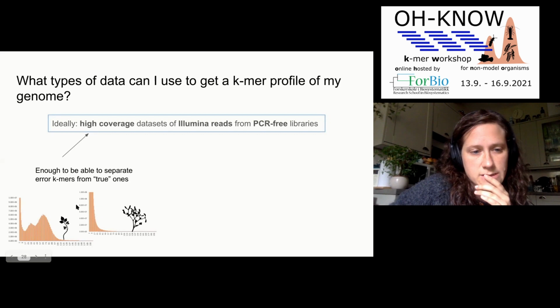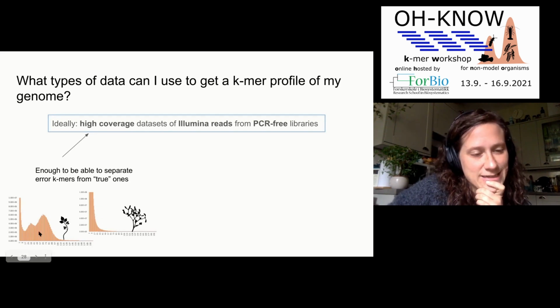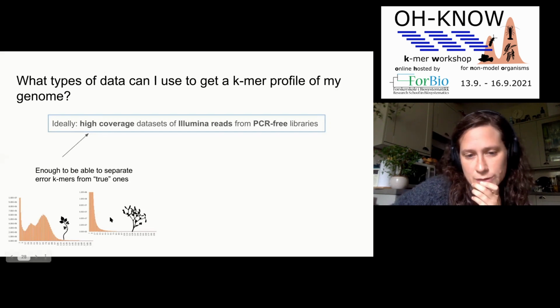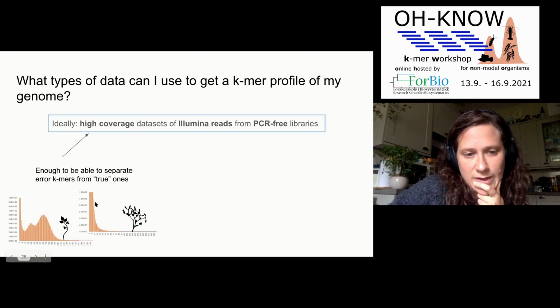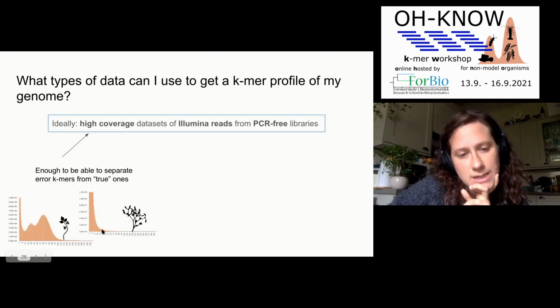So here, this is the case of another of my species from my PhD. And as you can see here, the heterozygous peak just overlaps with the error peak. So this can be a problem with your assembly. And this is just an extreme example of mistletoe. We're slowly sequencing mistletoe at the moment, but of course, because of the humongous genome size, at the moment, the coverage we have is so low that it's just one error asymptote. So everything is together.